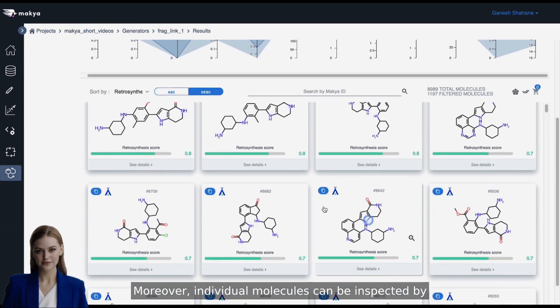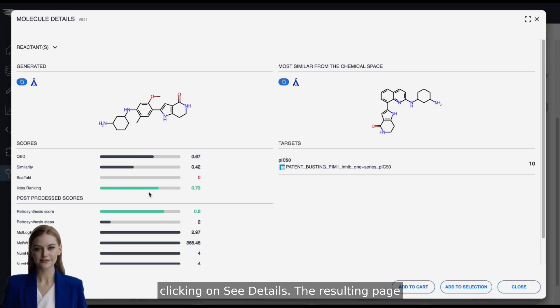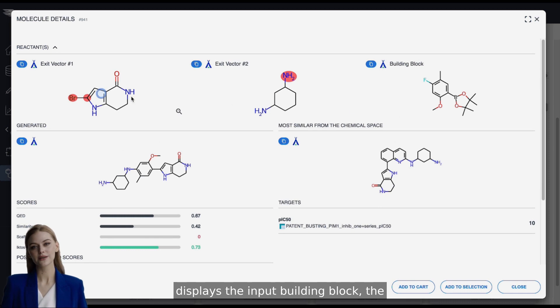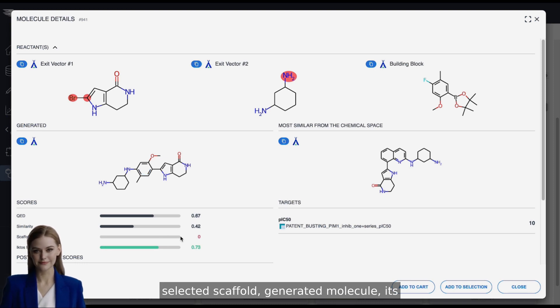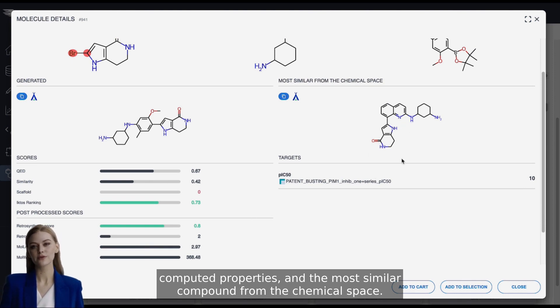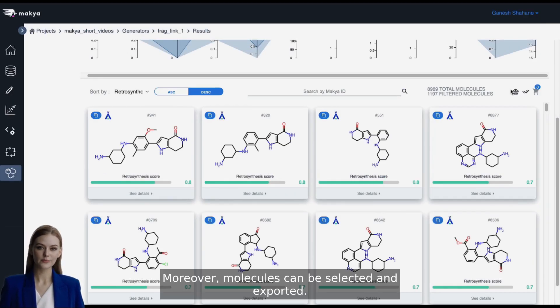Moreover, individual molecules can be inspected by clicking on See Details. The resulting page displays the input building block, the selected scaffold, the generated molecule, its computed properties, and the most similar compound from the chemical space. Moreover, molecules can be selected and exported.